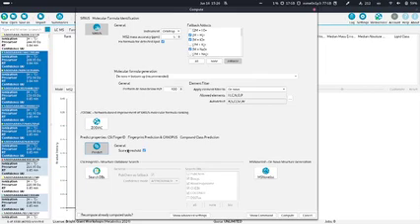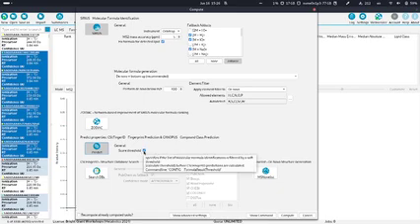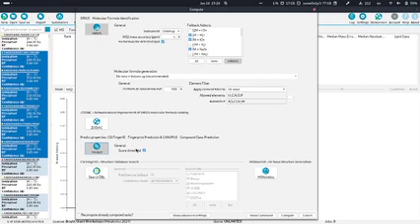Sometimes it might be the case that you have good molecular formula annotations, but you don't have any good structure hits. And sometimes it can be a good idea to then toggle off this button, so it will do the predictions for all the molecular formulas. But by default, if you also don't want to have too much runtime, it's probably a good idea to leave this option on.